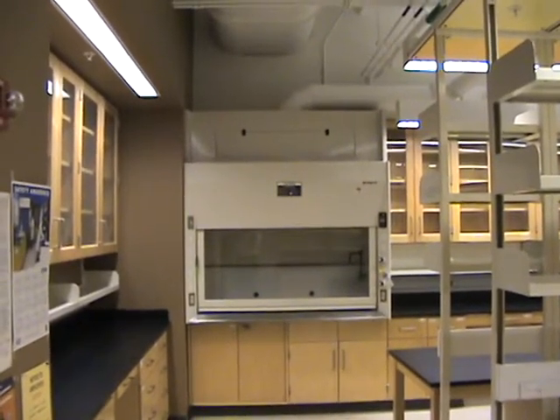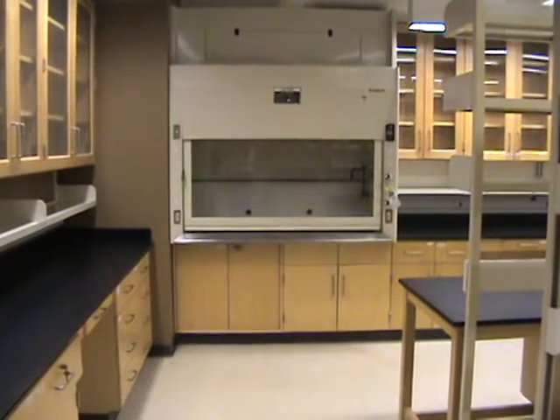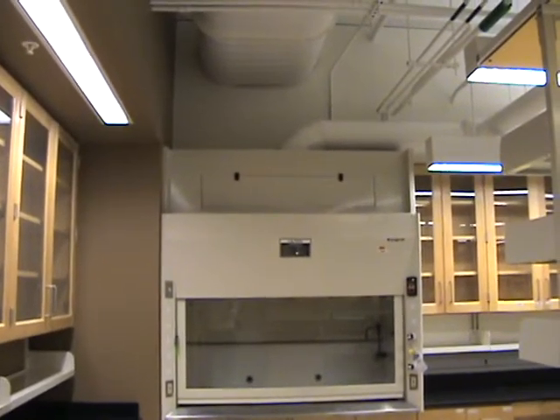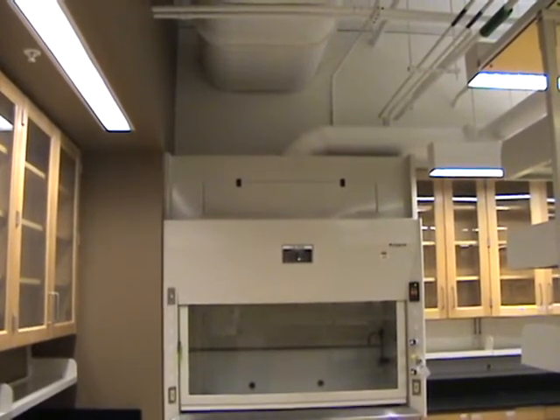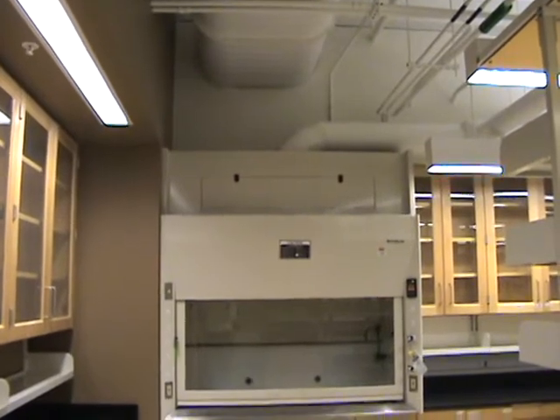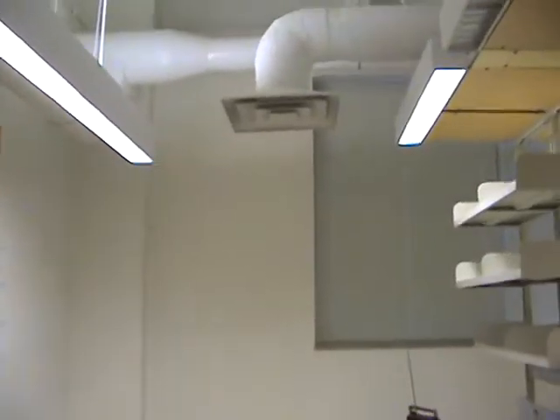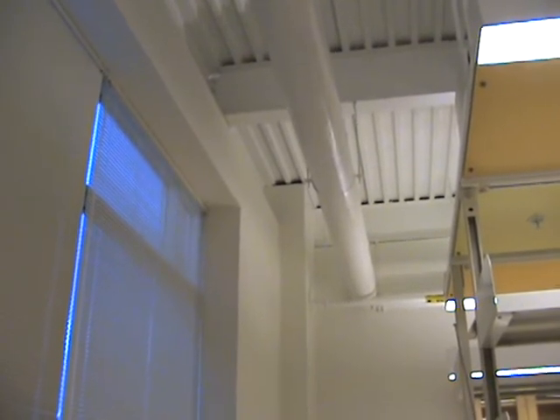This is a typical six-foot fume hood in a laboratory in an incubator. It is mounted on the casework up against the wall of the lab. On top, this particular fume hood is vented into a separate air handling system in the building, which is separate from the main heating, ventilating, and air conditioning system. That ductwork feeds into a main lateral system running along the entire length of the incubator, then goes up to the top of the building where there are twin fans that vent the entire network of fume hoods.